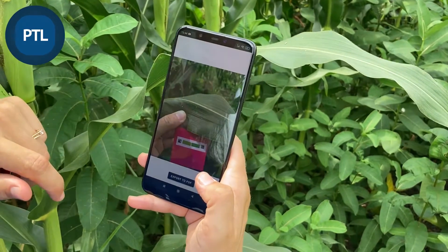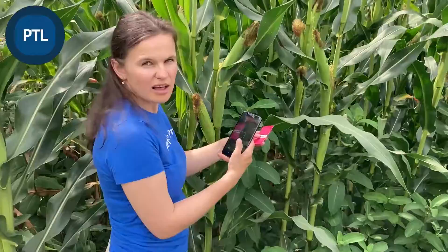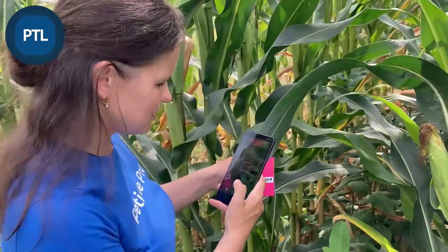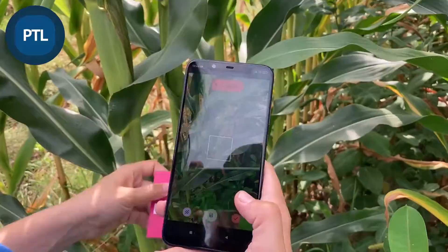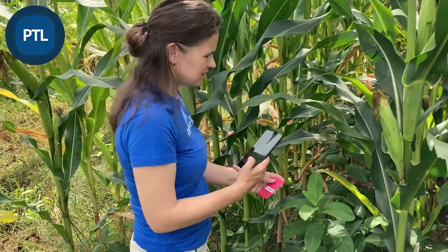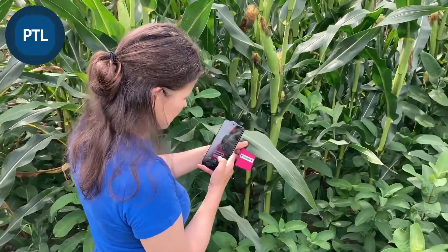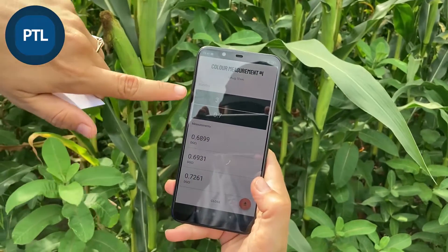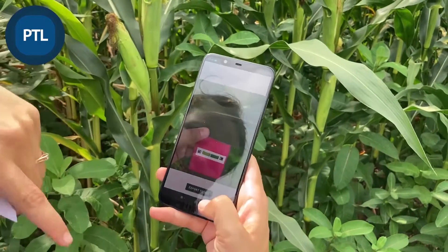Then press the button 'Save' and if we close the session we can see the number of measurements and also a picture of what we got. We can continue and do as many measurements as we want. For example, we can use another leaf, do the same algorithm, save the measurement, then use another leaf to find the average. If we close the session we see the number of leaves, the average greenness, and also the DGCI for each measurement. If you press a result, you can see the picture of that measurement.